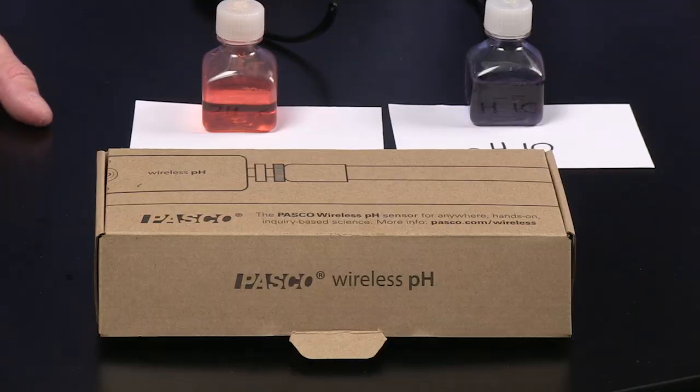Hi, I'm Tom Leschiavo, Education Manager at Pasco Scientific. And I'm Ron Fielthaus, a training specialist here at Pasco. And today we're going to talk to you about the wireless pH sensor.